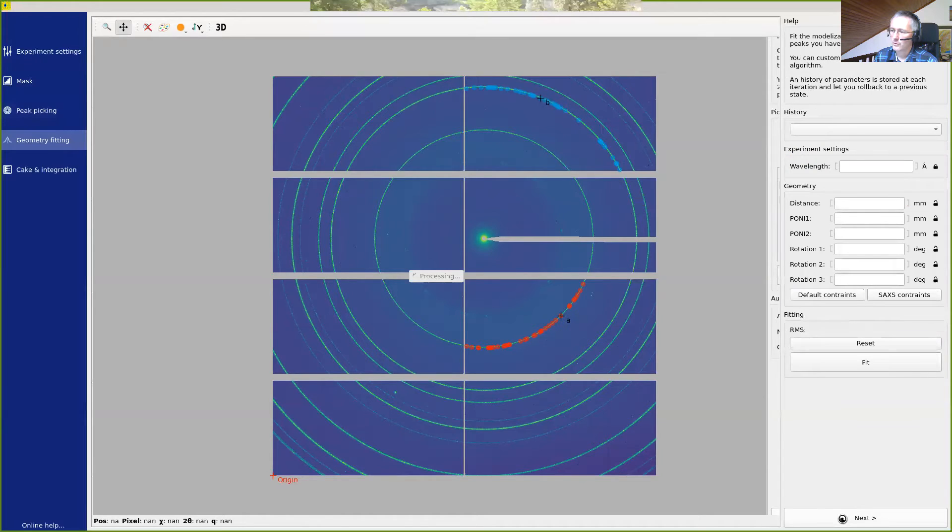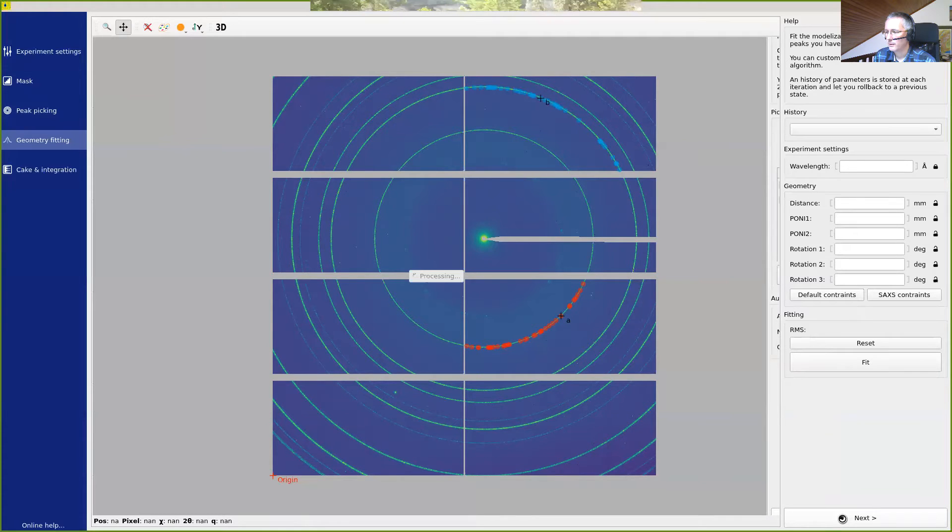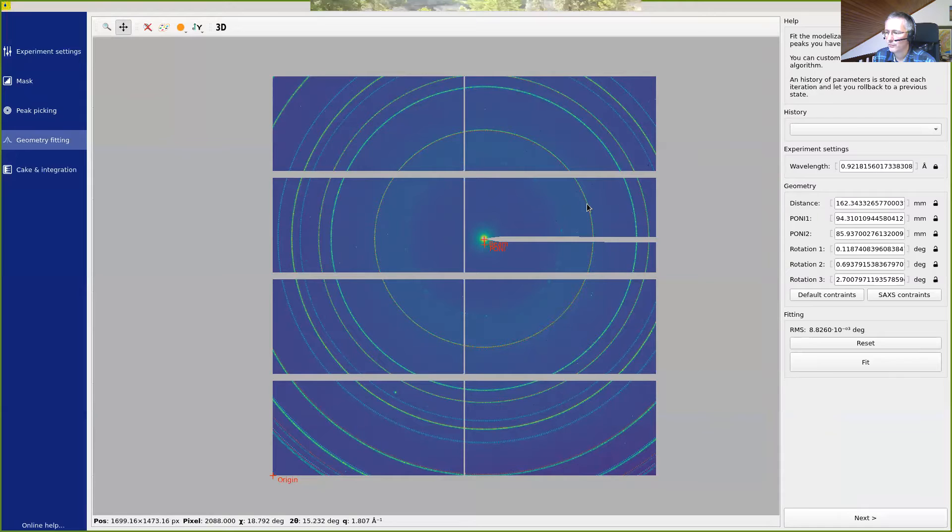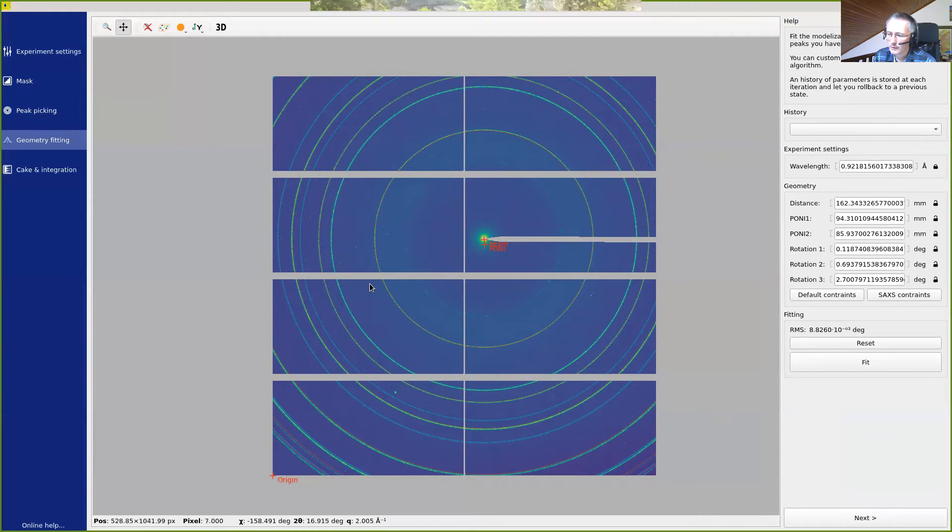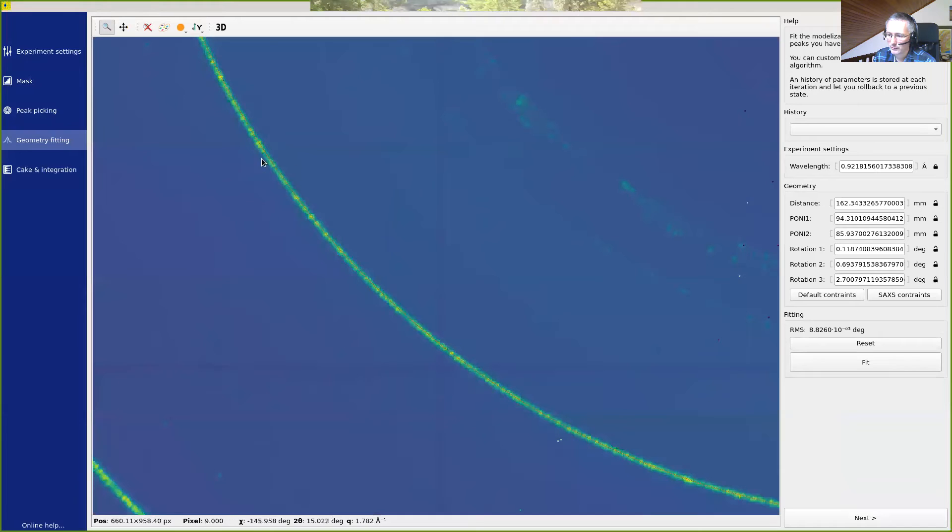So we'll get a rough geometry, but it should be not that bad. So PyFiFi is calculating. And now we can see overlaid the ring with the expected ring position. So you can see it's not that bad.